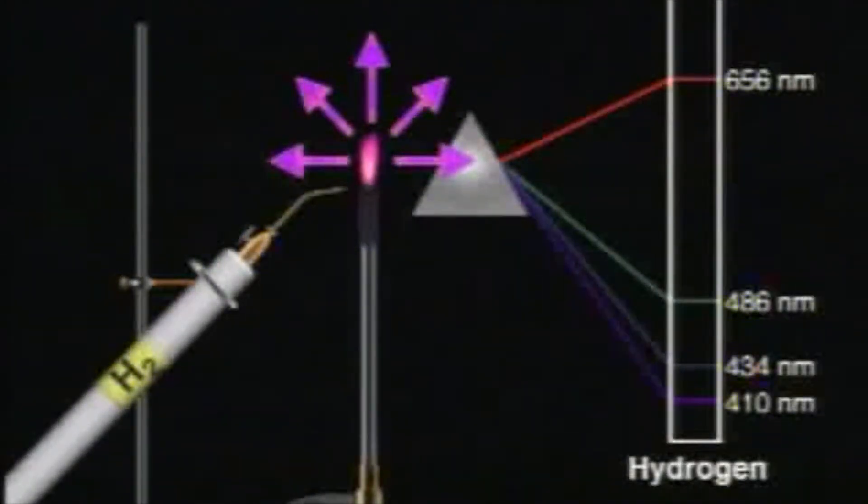If a sample of hydrogen gas is heated, it gives off light. When you view this light through a prism, you'll see an emission spectrum consisting of bright lines at specific frequencies.